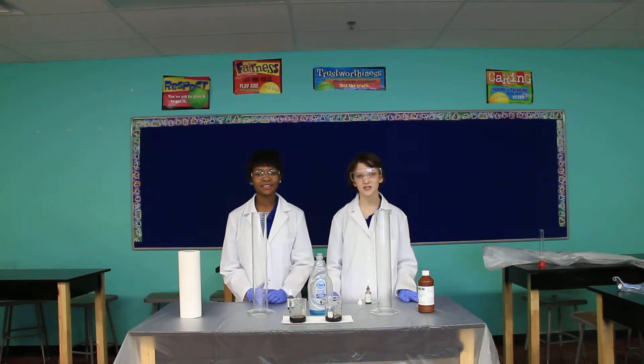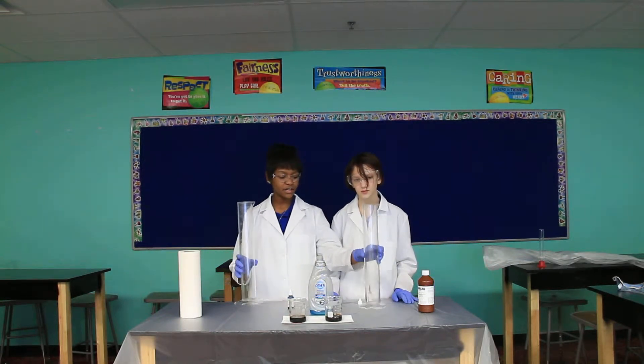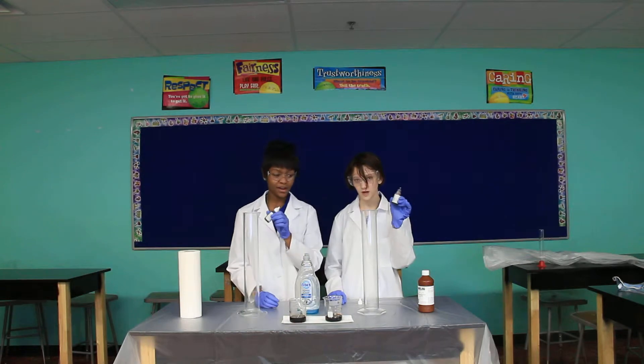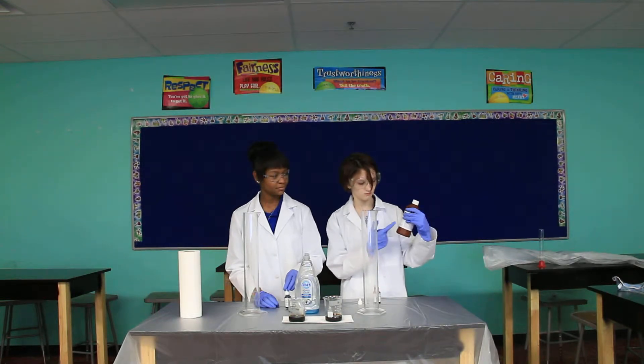And today we're making elephant toothpaste. Here are the materials that we're going to use today: two graduated cylinders, soap, food coloring, potassium iodide, and hydrogen peroxide — 30% solution.